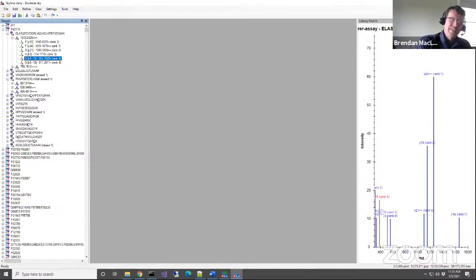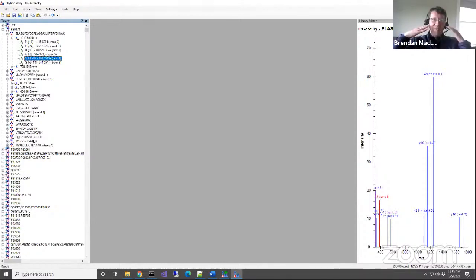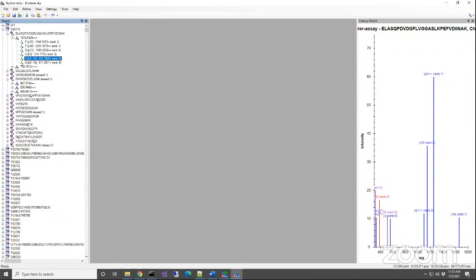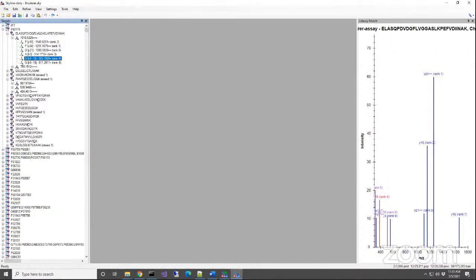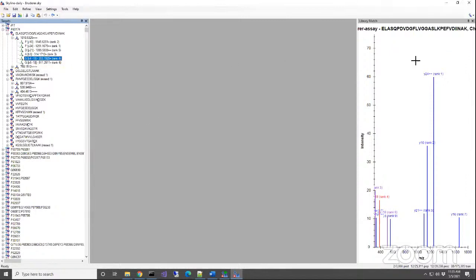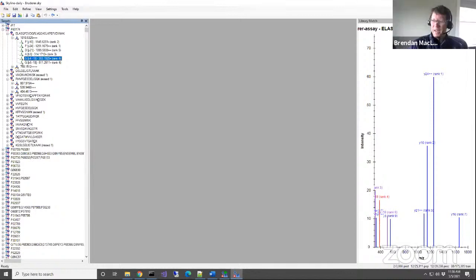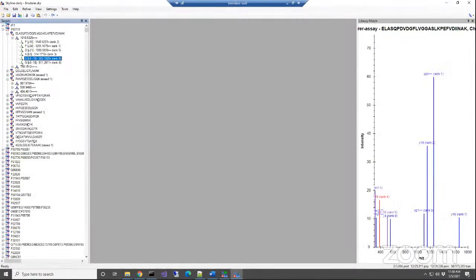I know that we're not considering them in scores, but I have a vision of the code that sets the boundaries on the peaks, and I don't know whether Nick correctly excluded non-quantitative transitions from that. Hopefully he did, but if he didn't, that's a bug. We've got to go ask him. Let me take a note about this.